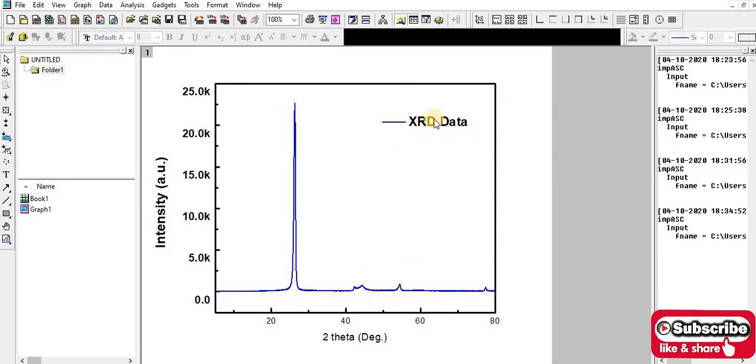And okay, if you want to write the peak position, how can you write the peak position? You have to select on that part and click here, and whatever you want to write, you can write. Okay. So this position is 002 peak, so I am writing 002 peak. If you want to make it bold, then you have to select and bold. Okay, so this is the process. And another thing, if you want to measure the peak position, then I will show that in the next lecture. So this is the process.